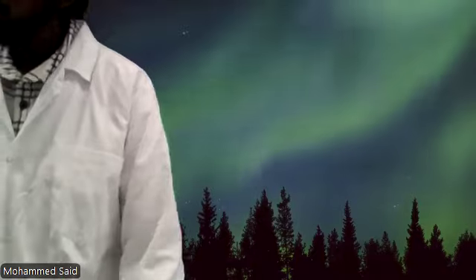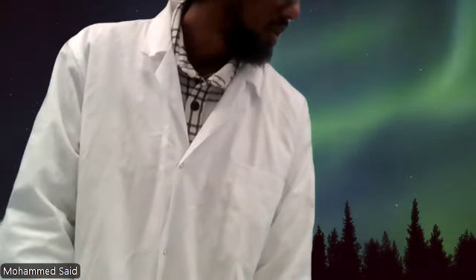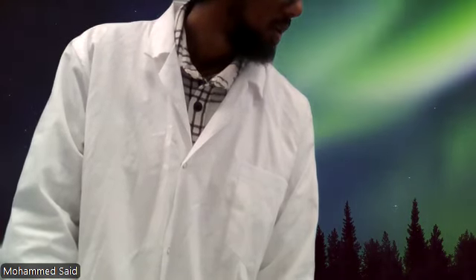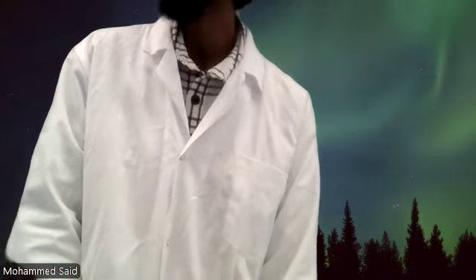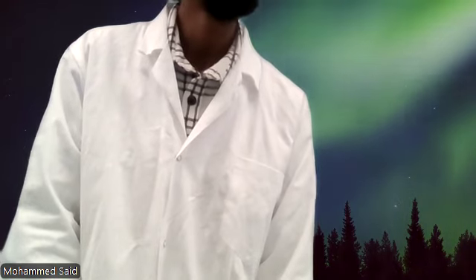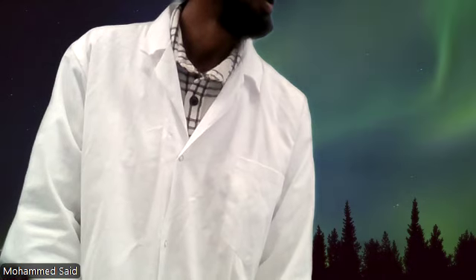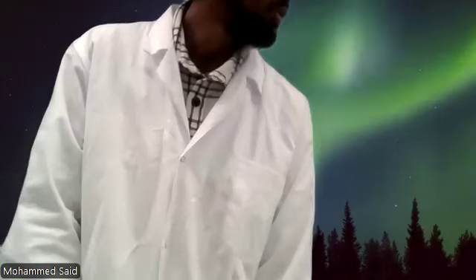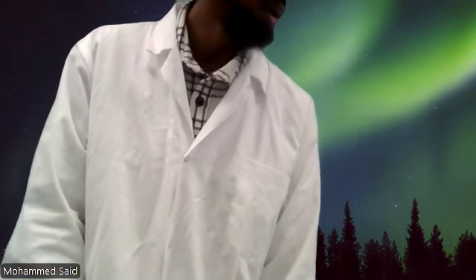Just before I do, sorry, we have the capsule. Anyone using this slide, just in case, I know some people are going to the capsule stain. I'll move forward to the capsule stain if needed. But the point is, pretty much after the capsule stain, motility test, and acid fast stain, we're ahead.